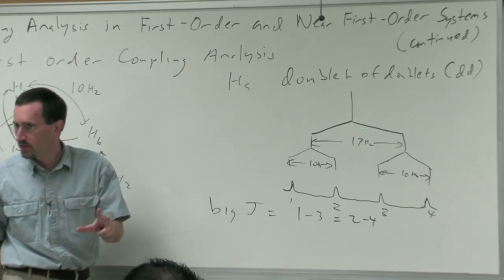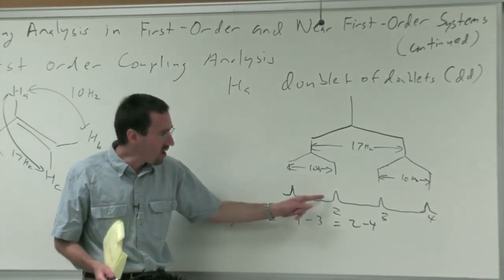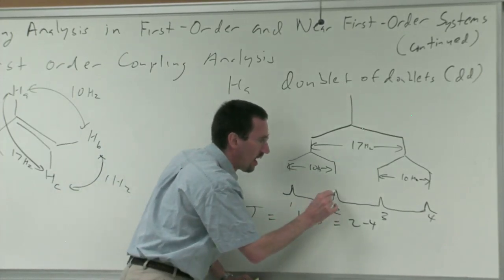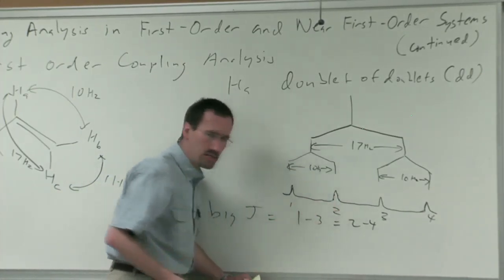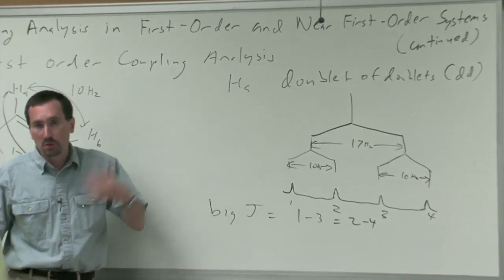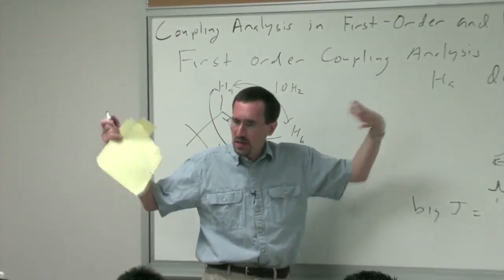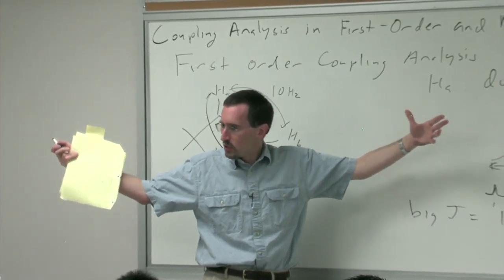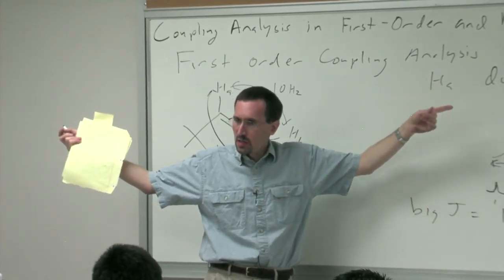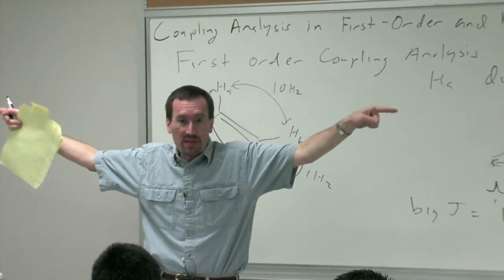Because there is experimental error in peak positions because of things like digital resolution, which says although your NMR spectrum is depicted as a series of smooth curves, each curve is actually composed of a series of data points, and the separation of those data points depends on your sweep width and your acquisition time. Typically, you have about 32,000 to say 50,000 real data points divided over the entire width of the spectrum. So if your spectrum width is 14 parts per million and you're at 500 megahertz, so your spectral width is 500 hertz per ppm, your sweep width is 7,000 hertz.